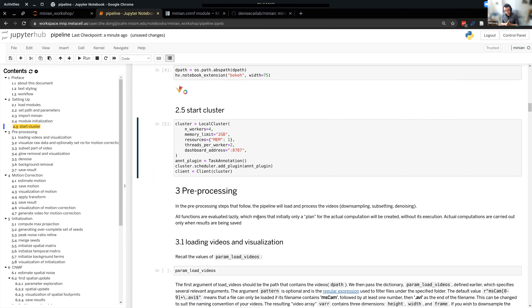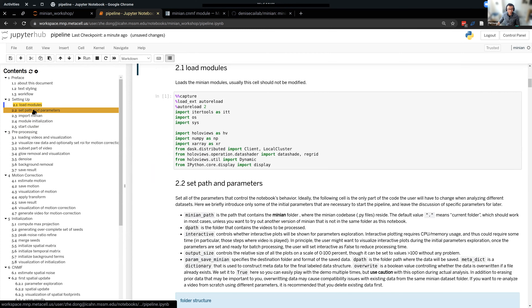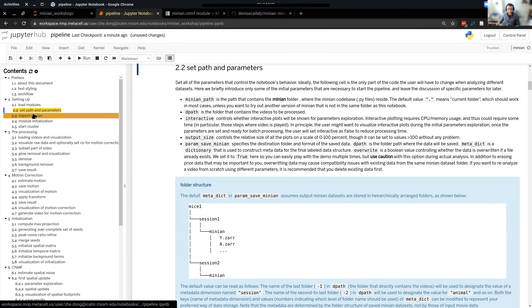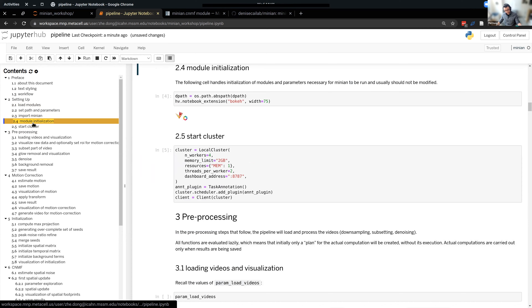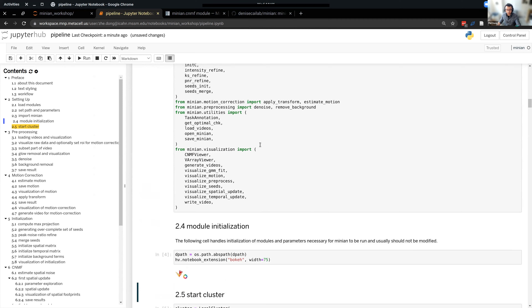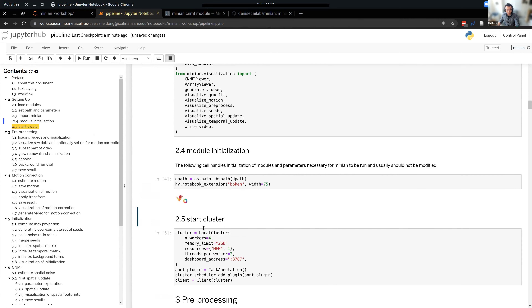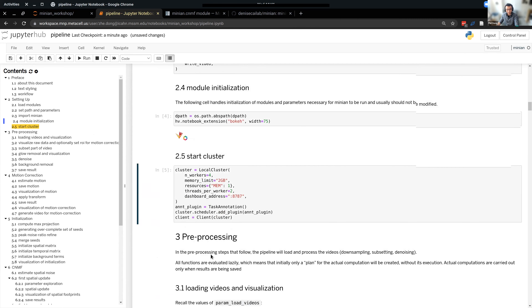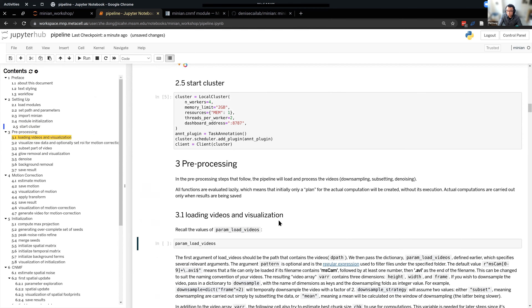The closing remark for the setting up part is: remember all five setup lines must be run every time you restart the kernel. That's intuitive because you're importing stuff, defining stuff, and starting a cluster — of course you want to make sure you do that every time you have a clean, fresh kernel. Now, if there are no more questions, I'm going to go ahead and move to the actual preprocessing step.